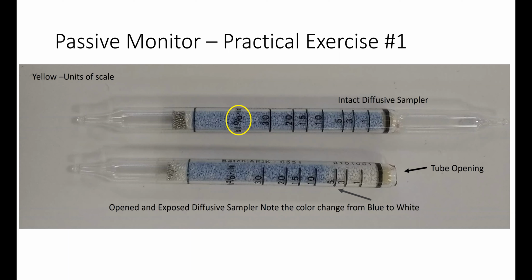Industrial hygiene, gas and vapors, lab number 5. Okay, starting with this is the passive monitor, which is practical exercise number 1.